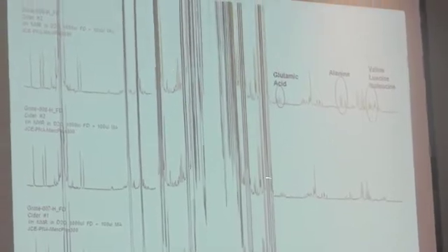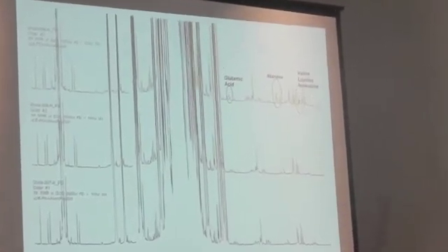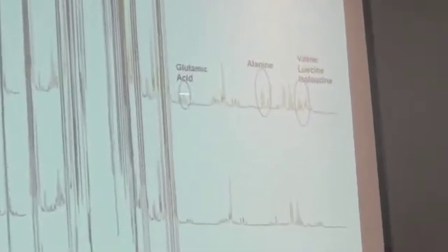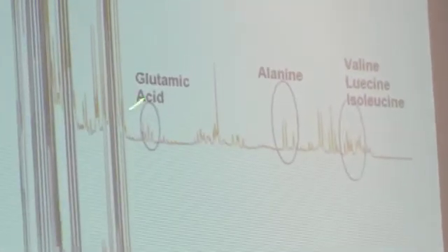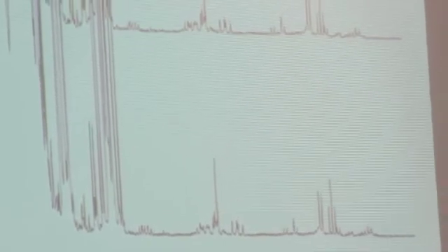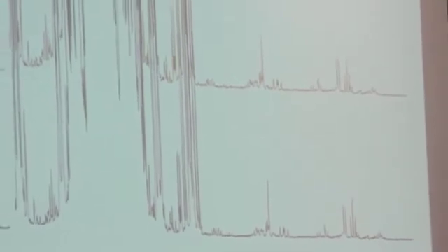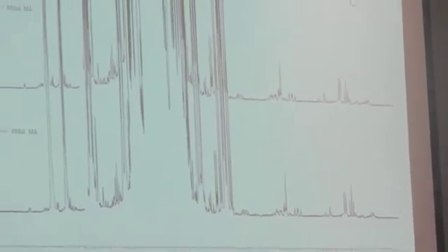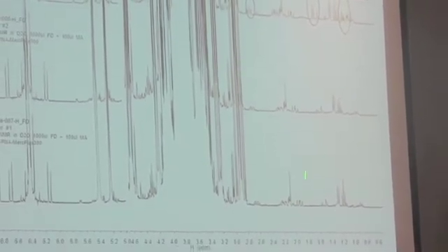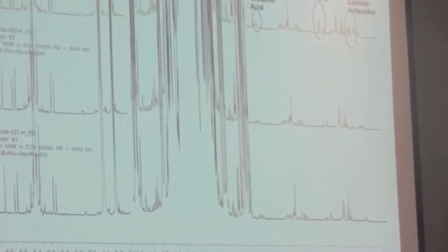But when you zoomed into the baseline, we could actually pick out the nutrients that the Scott Labs product had added in, all the different amino acids that are in there. Down here, you can't. I couldn't really tell the difference in the nutrient depleted one. So when he said he got the nitrogen out of there, I think he just precipitated all the protein. It wasn't really freely available amino acids. So to me, these 2 kind of look the same. I can't really see the protein, but I can see the free amino acids that the yeast would use.